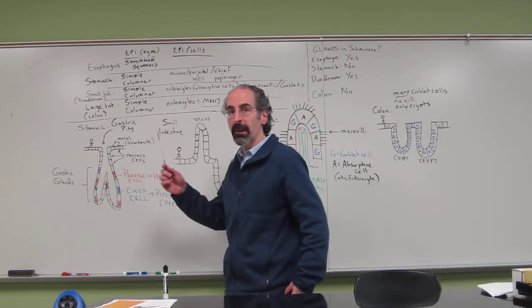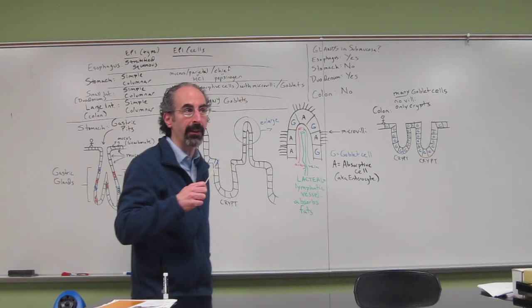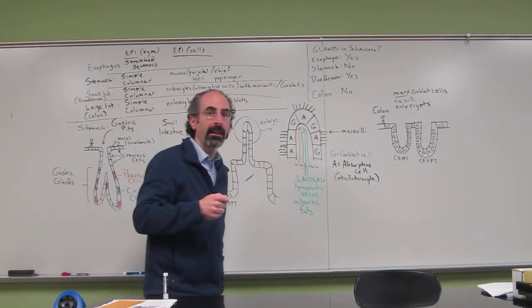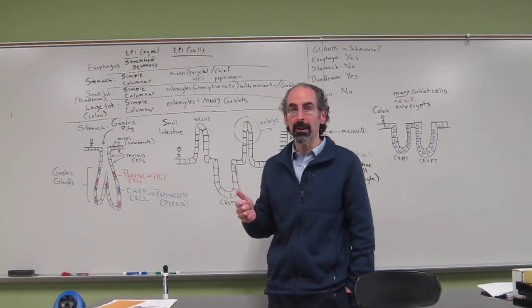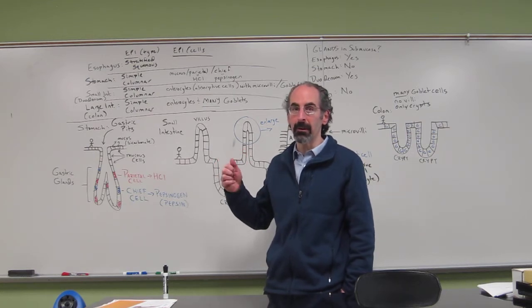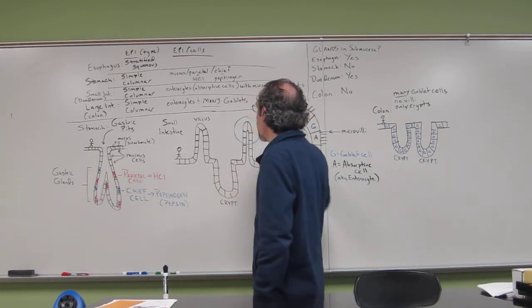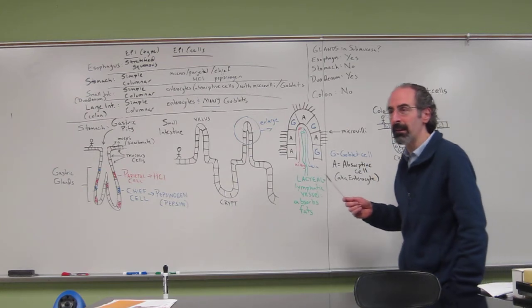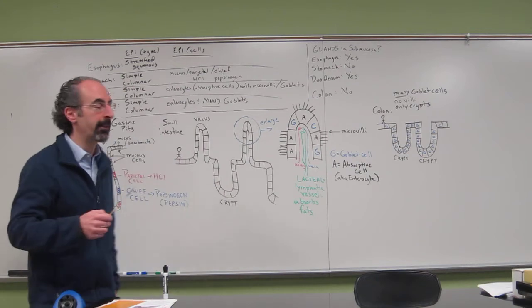Okay, I'm going to go through this quickly, and I apologize for the quickness. But again, you can review this on your own time, and in theory, what you should also have open with you is both your lab manual as well as a copy of your textbook, either in print or digital version, to go through this together. What this tries to do is put all of these 4 structures compared side by side, so you can see it all in one field of view.